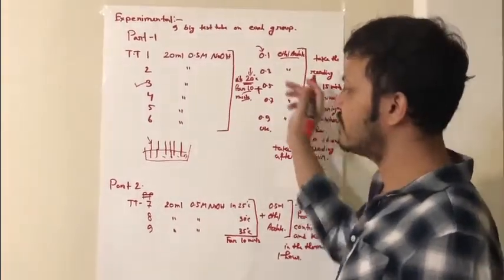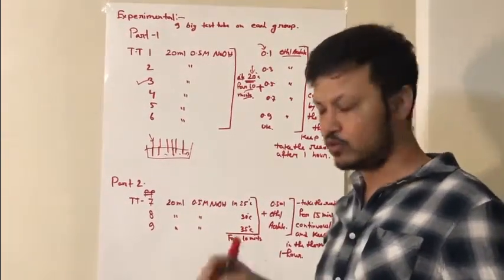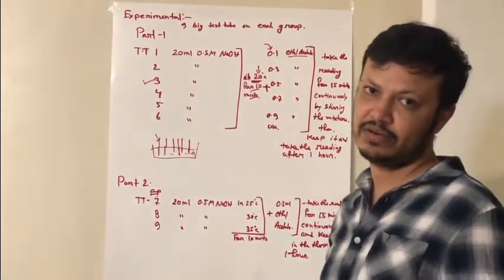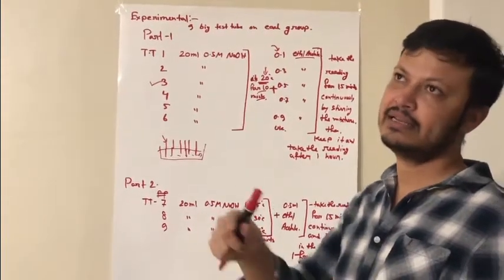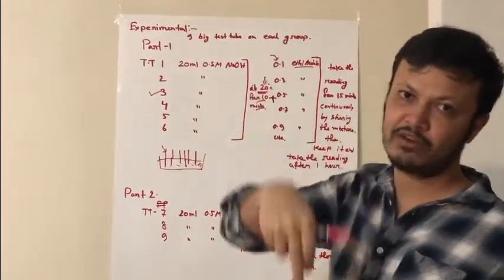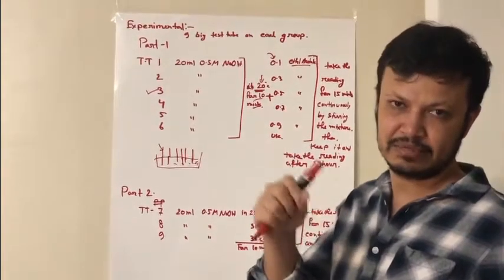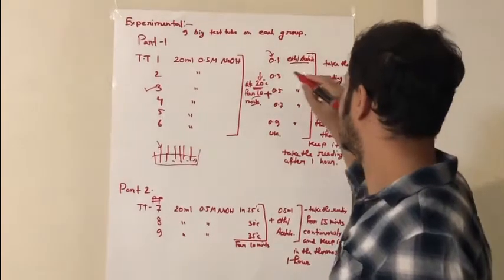Before adding, first of all you have to take the conductance. You know how to do the conductance. You put in the probe and measure the conductance, and when the conductance is stable, then you add 0.1 ml of ethyl acetate, and after adding you have to stir it a little bit so that the reaction goes in process.